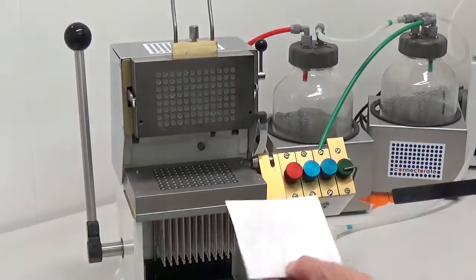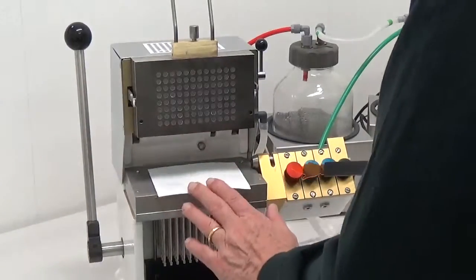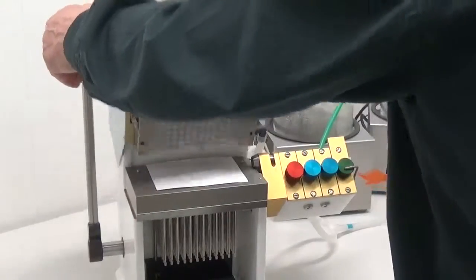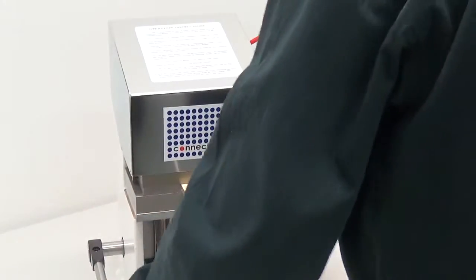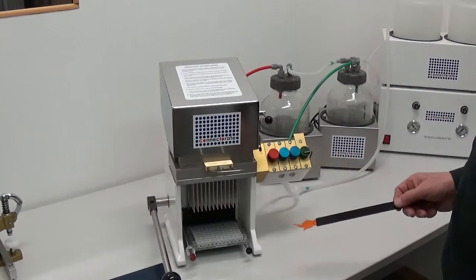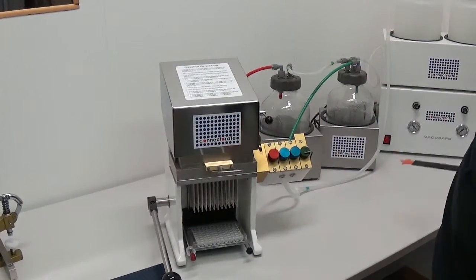Now you can place the filter mat on the pipetting head and close the harvester again. Now you can start the harvesting and the pump system.